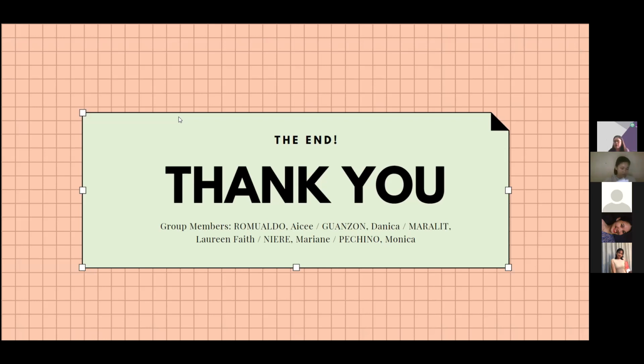Conclusion. After finishing this activity, we all have learned that it is very important to make sure that we are protected inside the laboratory. We need to wear protective gear such as goggles, hairnet, gloves, and lab coat. Wear clothing and shoes that cover our exposed skin and protect us from potential splashes. Tie back our long hair, and hide or remove our jewelry or anything that may catch in equipment.